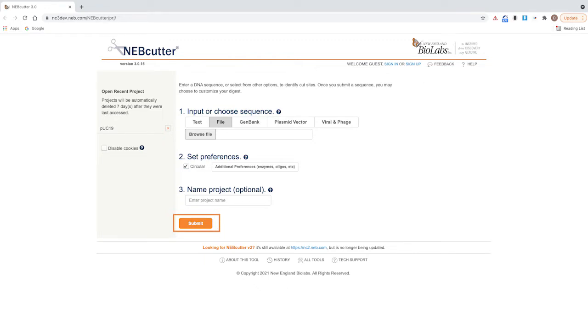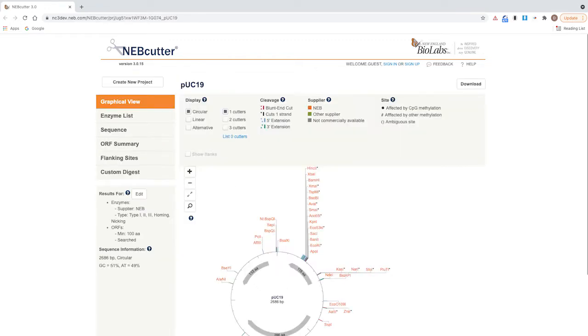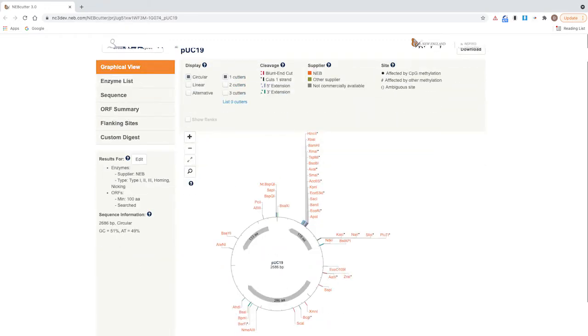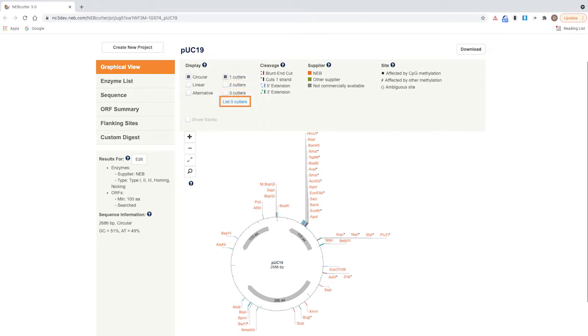Click submit. On the default graphical view page, you can select one cutters, two cutters, three cutters, or list zero cutters.